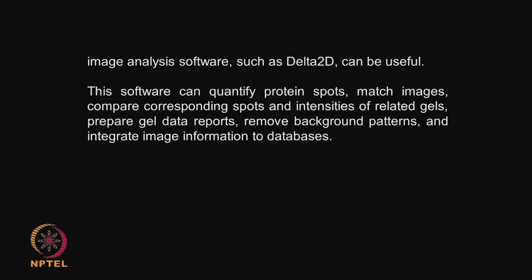Nowadays there are something called spot pickers, which can, using an electronic system, pick out a specific spot and, without a human touch, directly inject it into a MALDI using a solvent, and then identify the molecular weight and the sequence of those proteins. So, such advanced studies could be done with the 2D gel, which I showed you.